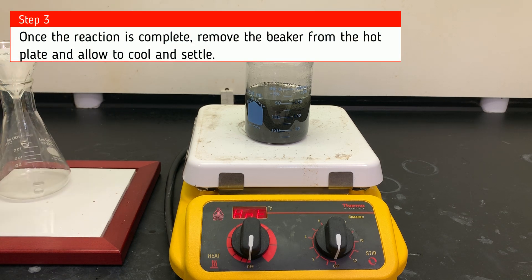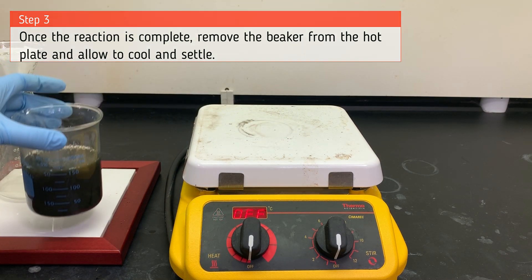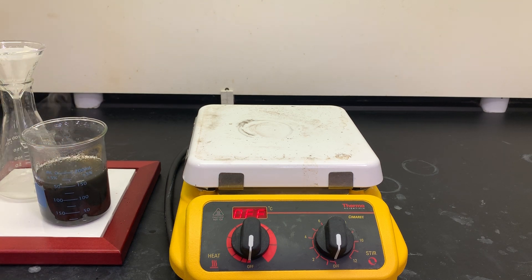Now that our reaction is complete, we're going to remove the beaker from the hot plate and allow it to cool and allow that solid to settle.